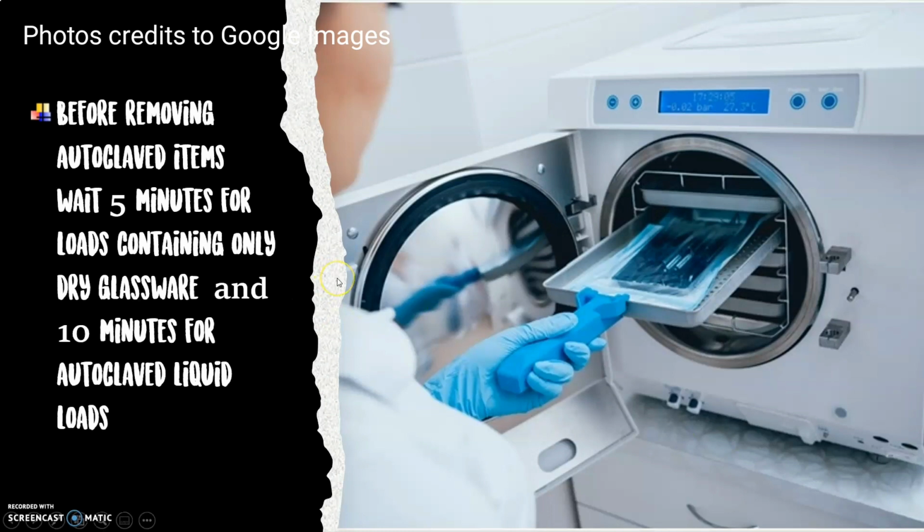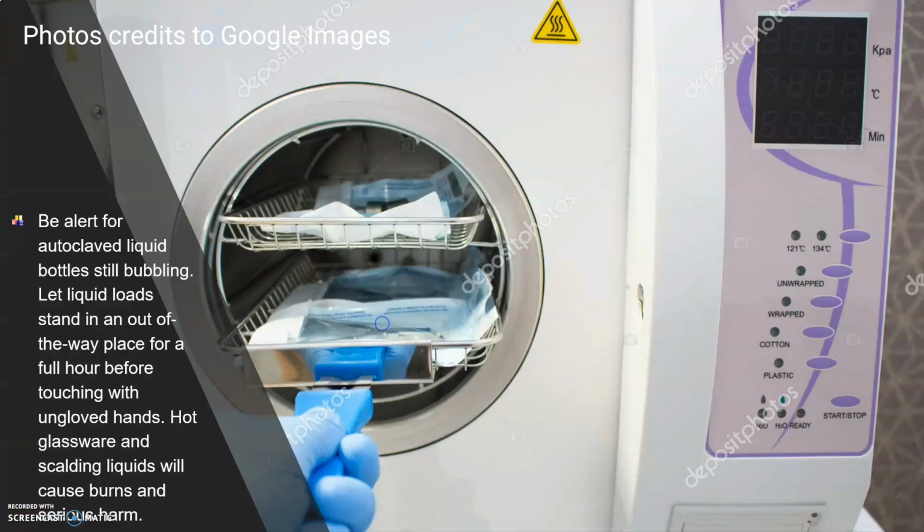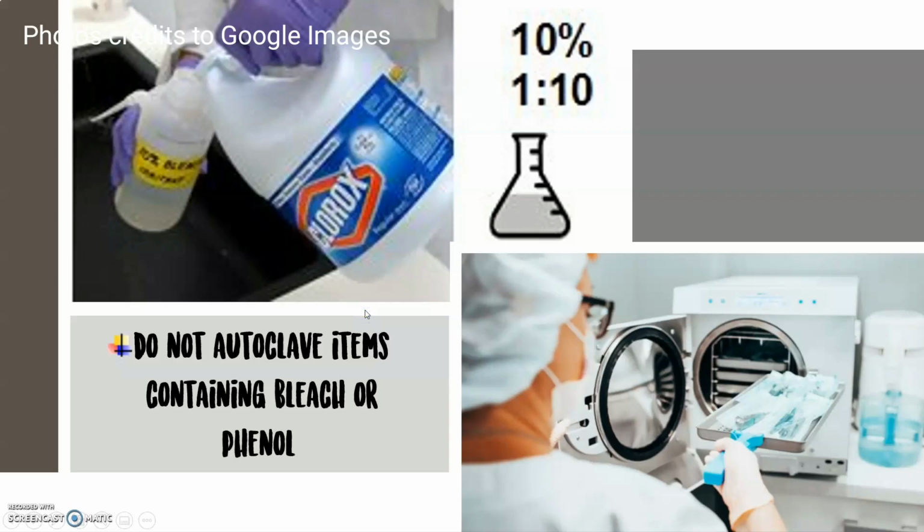And remember, before removing autoclave items, wait 5 minutes for loads containing only dry glassware and 10 minutes for autoclave liquid loads. When removing items from the autoclave, use heat-resistant mitts. Be alert for autoclave liquid bottles still bubbling. Let liquid loads stand in an out-of-the-way place for a full hour before touching with ungloved hands. Hot glassware and scalding liquids will cause burns and serious harm. Do not autoclave items containing bleach or phenol.